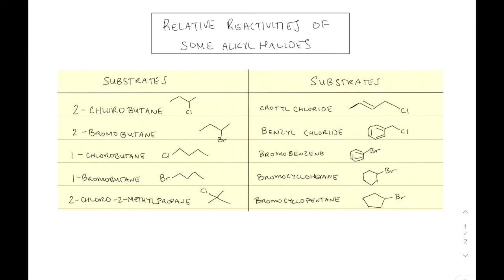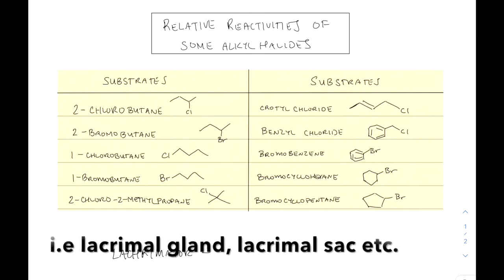Now those are all flammable liquids, okay? So they're hydrocarbons, right? So crotyl chloride on the upper right, as well as benzyl chloride, those are called lacrimators. And lacrimators are actually, here, let me write that down for you, lacrimator. And that's benzyl chloride as well as crotyl chloride. These are lacrimators because they irritate your eyes and they can cause tears. And so that is why they're called lacrimators. And this is one of the hazards that you want to write down in your table.